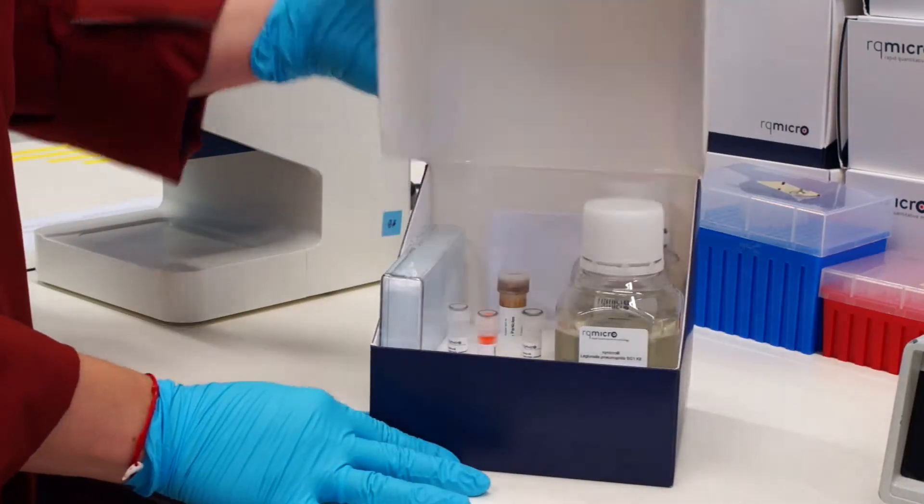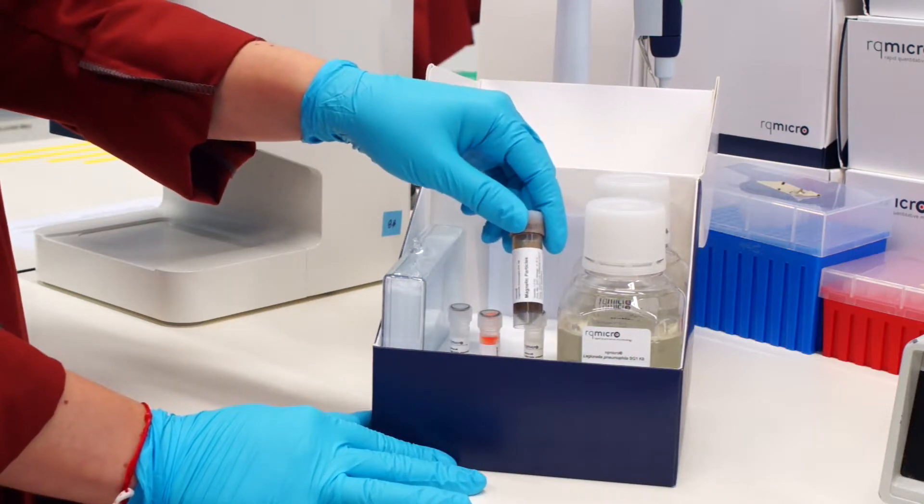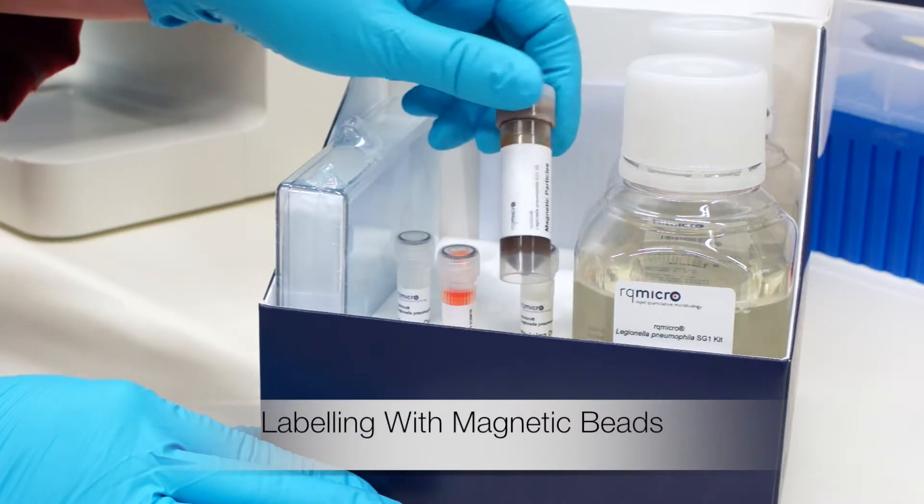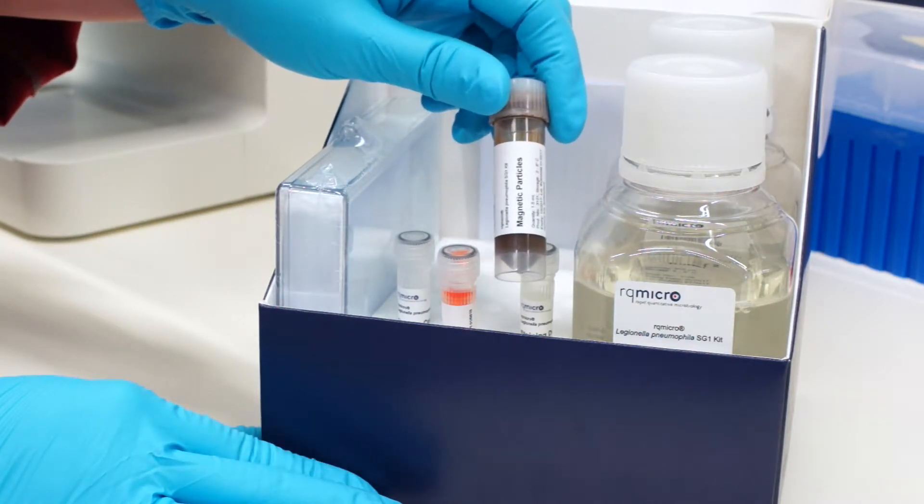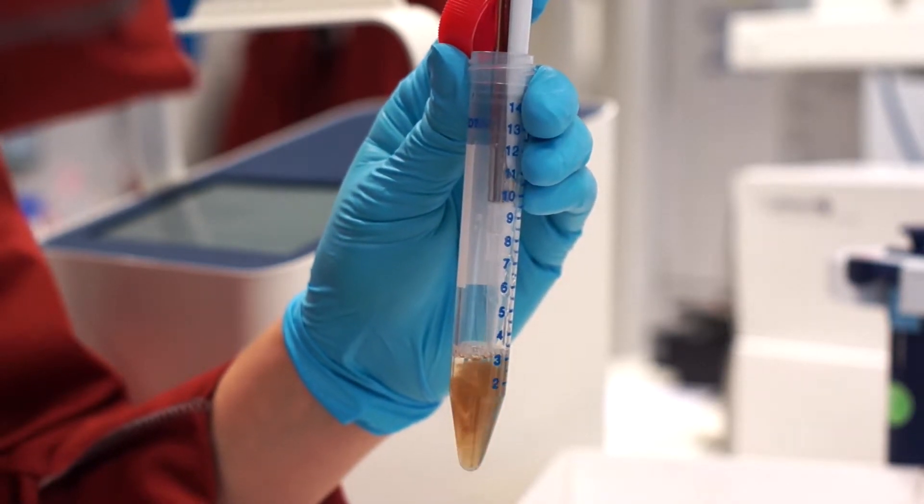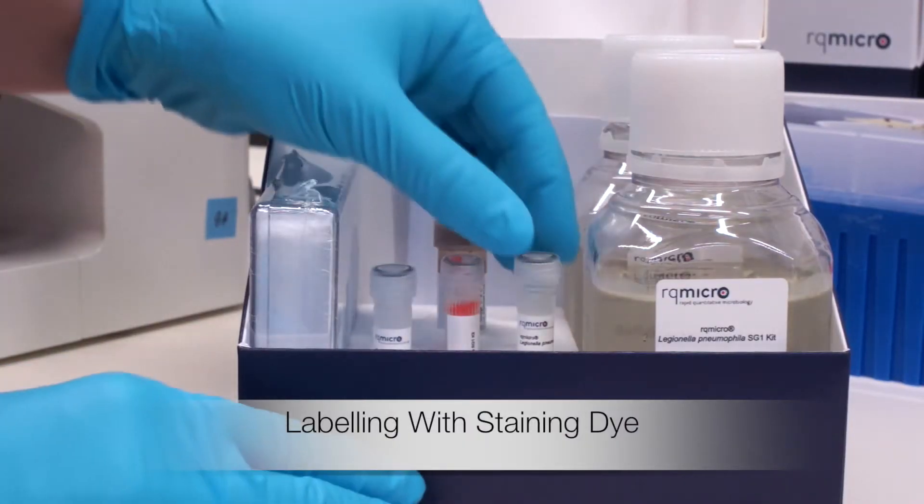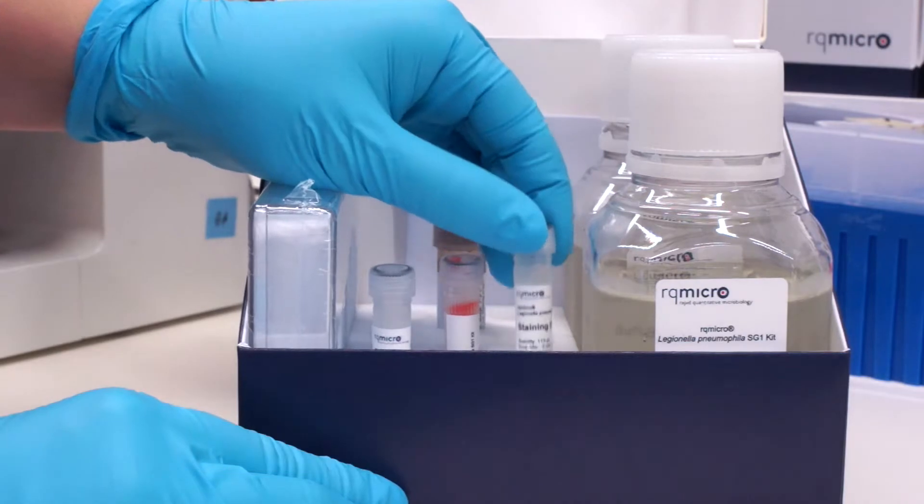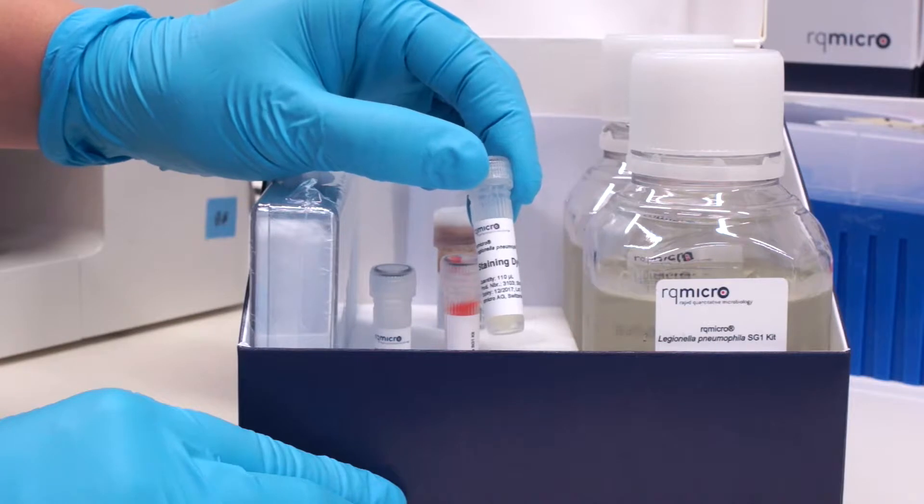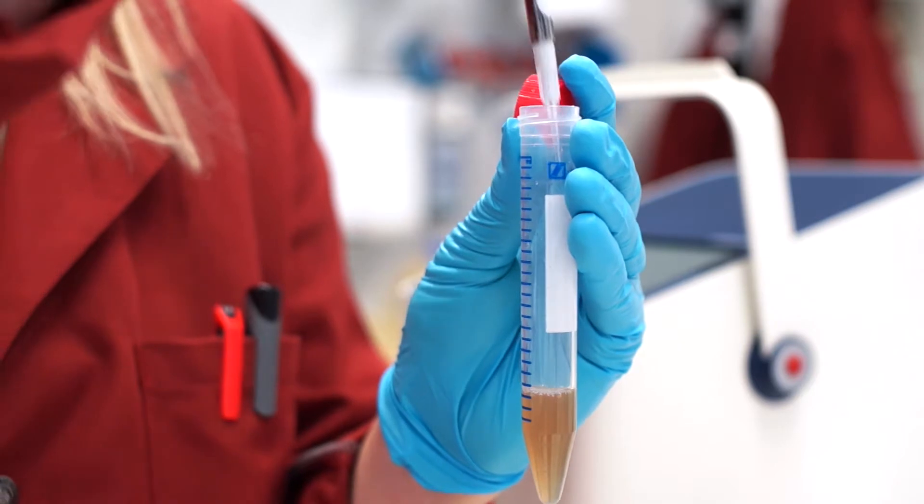Now I will add two types of antibodies produced by RQ Macro to my sample. This mix contains antibodies bound to immunomagnetic particles. They will bind to the target cells and thereby enable the immunomagnetic separation. I'm adding 30 microliters of the magnetic bead solution to my 3 ml sample. I'm also labeling the Legionella cells with antibodies bound to a fluorescent dye. Thereby I can quantify them with the flow cytometer after the immunomagnetic separation. I am adding 10 microliters of staining dye per 3 ml sample.